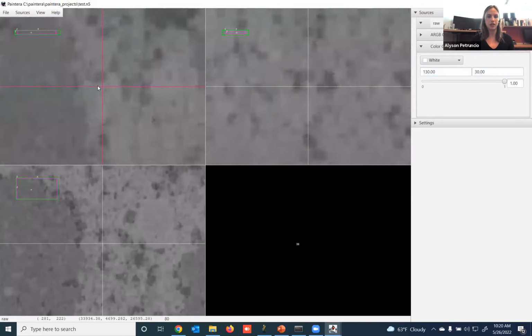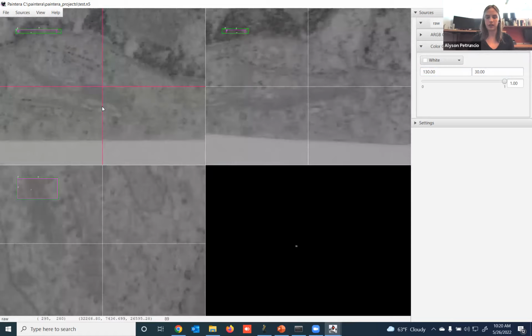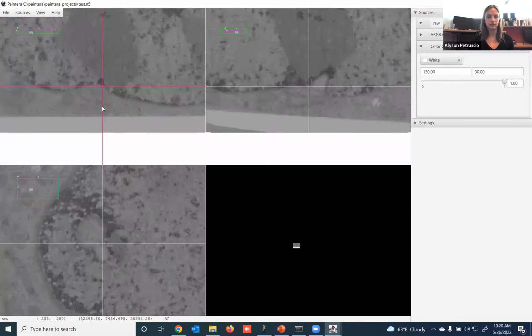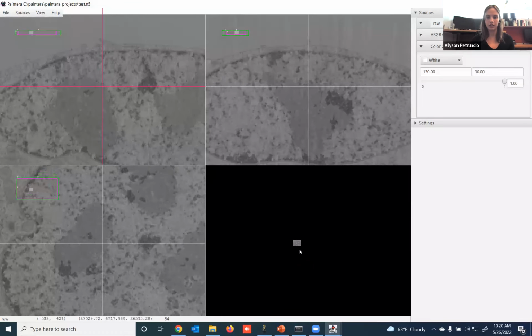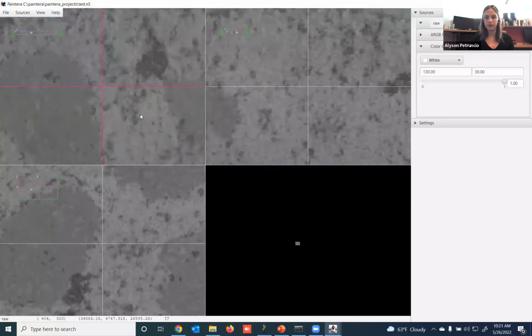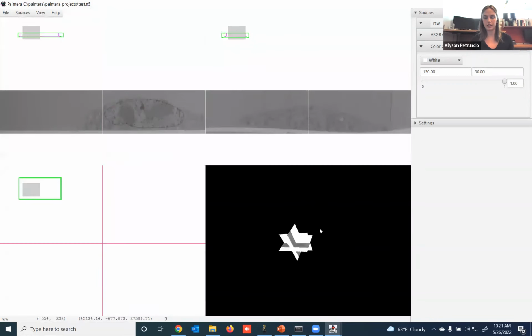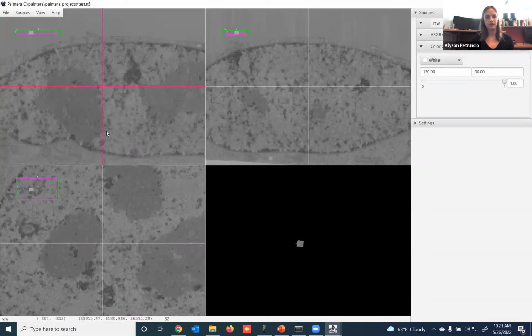And as we zoom in, we'll gather greater detail because this is a multi-resolution data set. And as you can see down in the 3D viewer, we see the orthogonal planes all intersecting, which will again come in quite handy when we add label data.